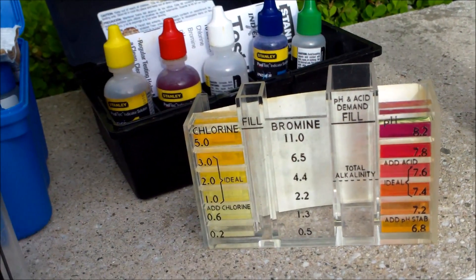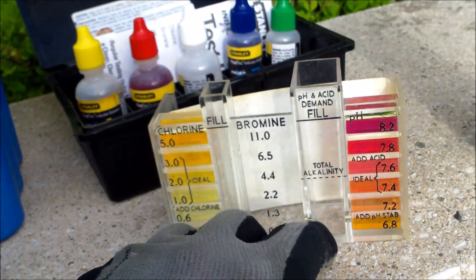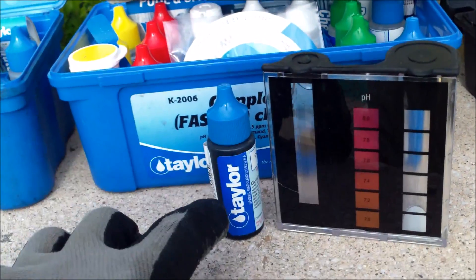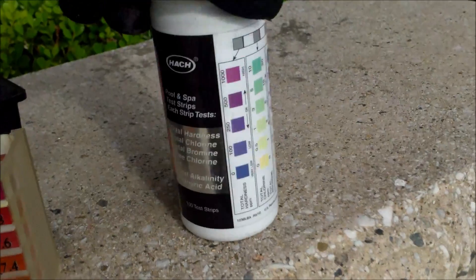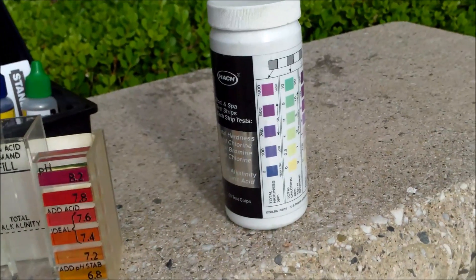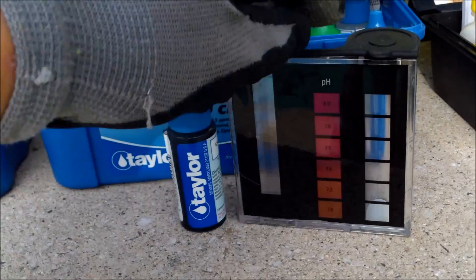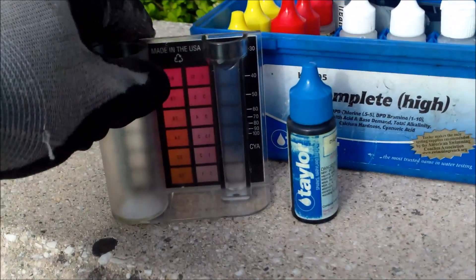The 5-way test kit covers chlorine, pH, acid demand, and alkalinity. The Taylor kits will also do the hardness — the calcium hardness test — and both Taylor kits do that. The AquaCheck 701 does a total hardness, which is different from a calcium hardness test. These two Taylor kits do an actual calcium hardness test so you can see exactly what the calcium level is in your water.